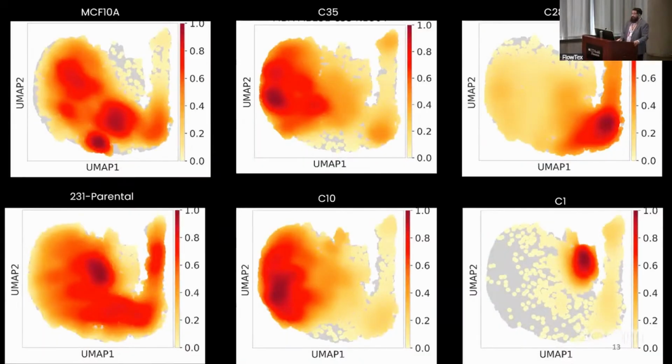So here's some data. We have MCF10A, which is a normal breast cell line. These are heat map UMAPs. We have MDA-MB-231 parental, and from that we isolated physical single cell clones and grew them up. They're all at the same passage number and the same densities, and then these were sent out. So we're seeing that these 4 clones can recapitulate their parent space, albeit in different spots.